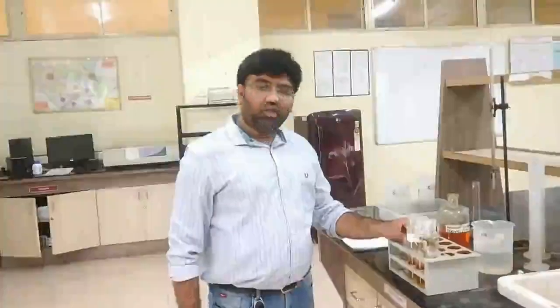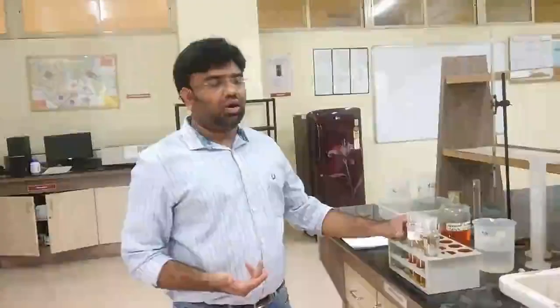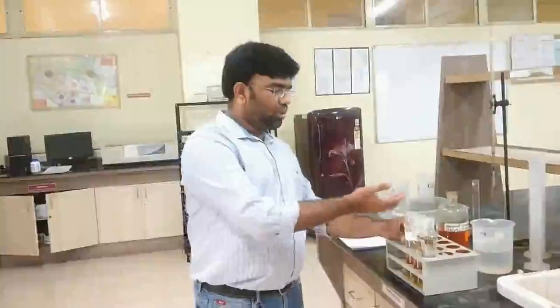Because we are going to heat these samples at 150 degrees Celsius for 1.5 hours, what may happen is that during this reaction the liquid will boil and try to come out of this particular flask. So the addition of glass beads will suppress that reaction, or absorb the heat.